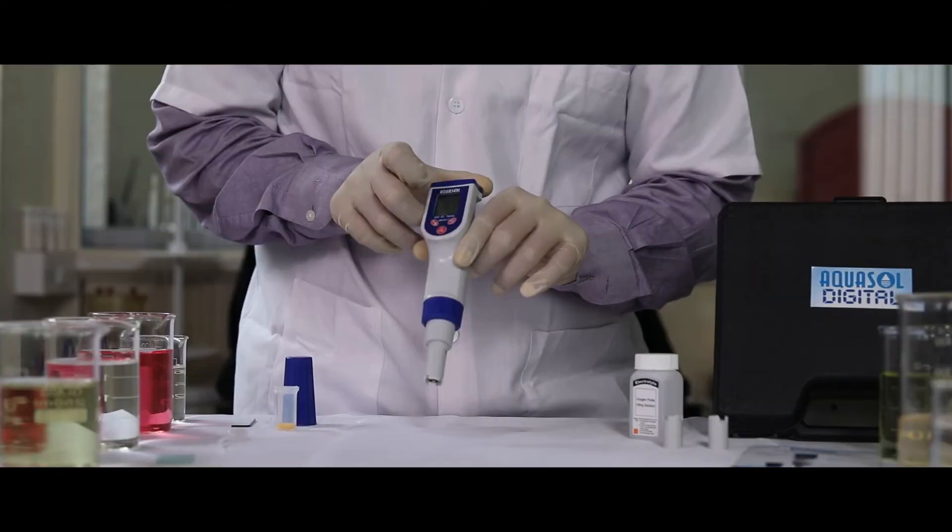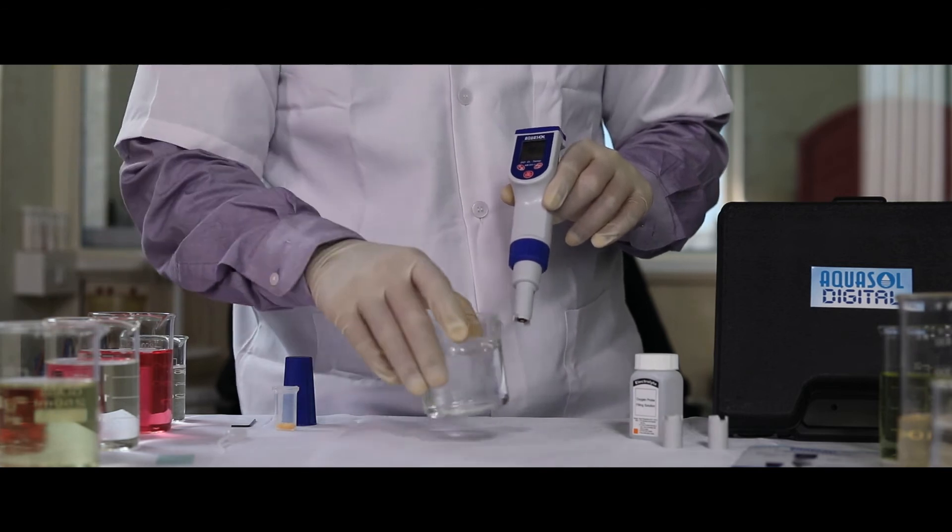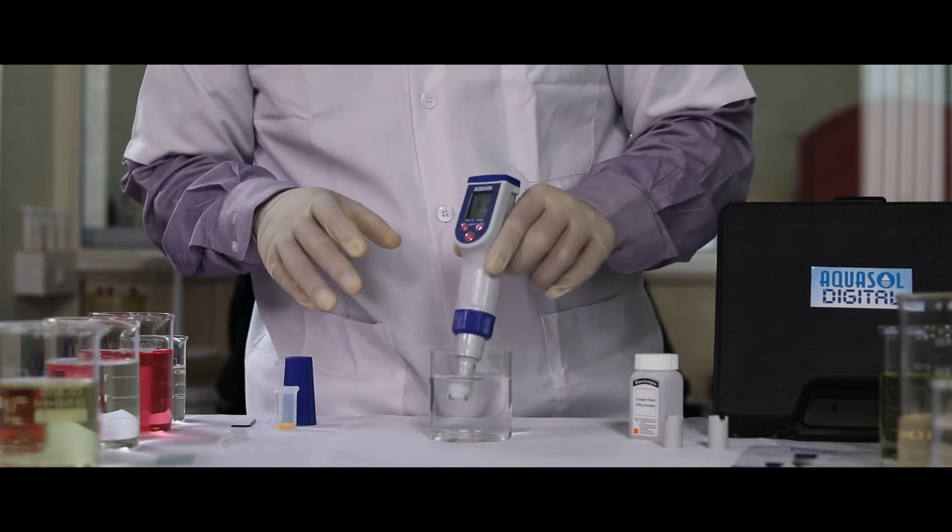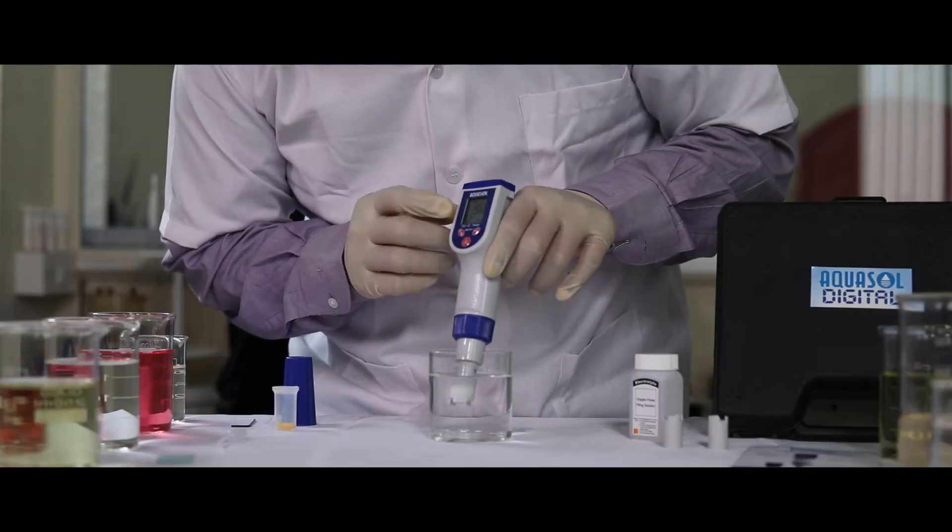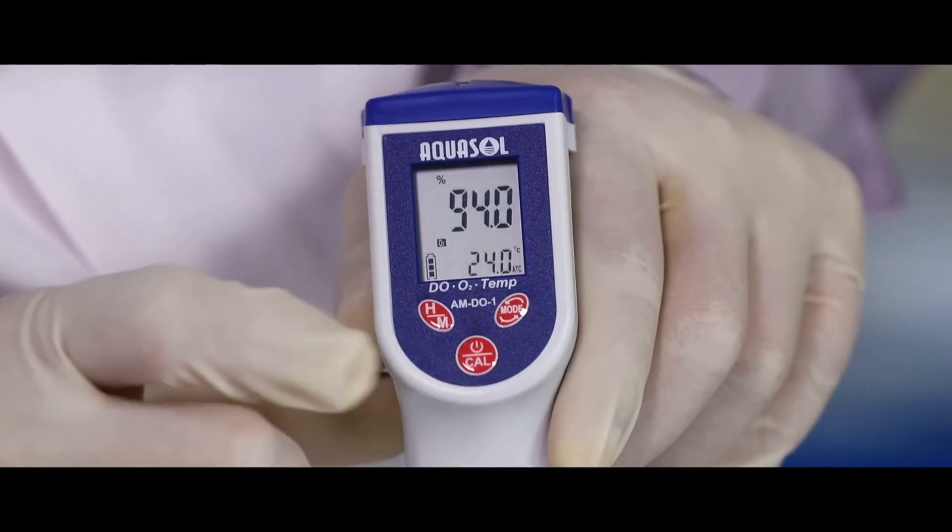Take the sample to be checked and dip the meter in the sample. Stir the electrode till the reading stabilizes. You can see the O2 value and percentage on the display.